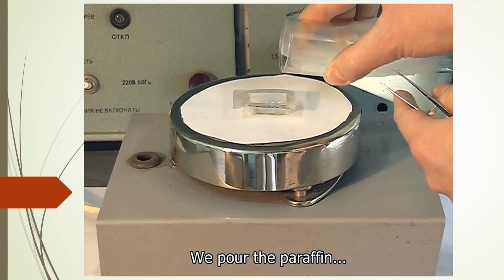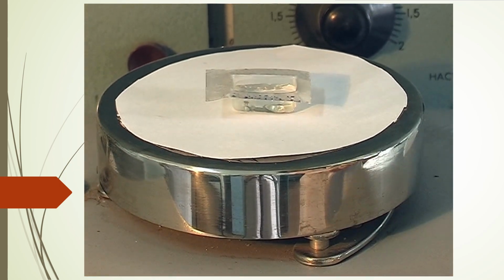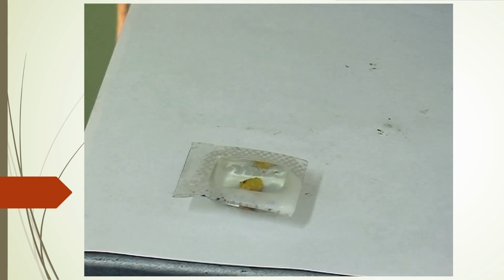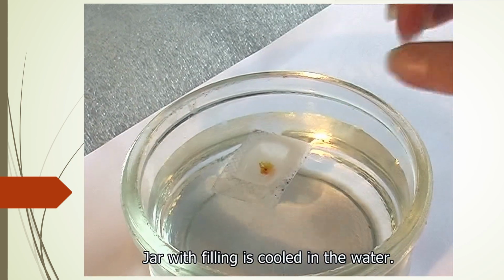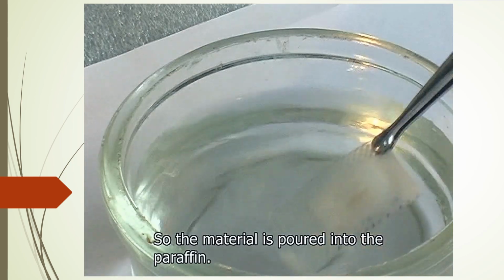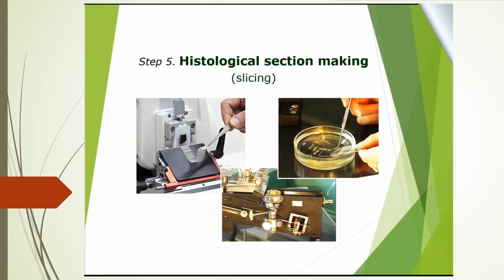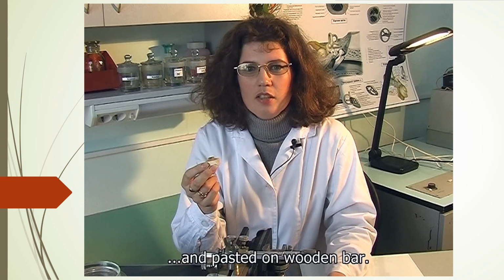We pour the paraffin, and then put the material into it. The jar with the filling is cooled in water. We wait until the paraffin has hardened. So the material is poured into the paraffin. This is the material poured into the paraffin and pasted on a wooden bar.